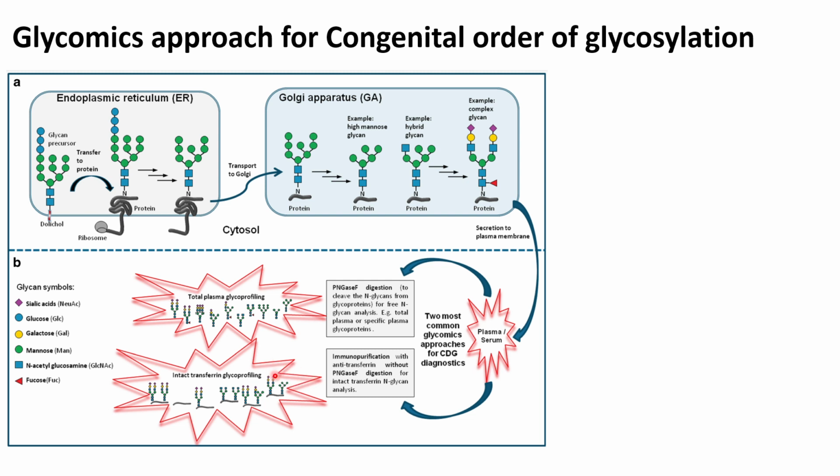So in this case, the glycans will not only get separated, but it will also take the protein backbone chain with it, which can be seen here in this bottom intact transferrin glycoprofiling figure. In this case, the antibodies detect these glycan structures, and then this glycan will also take the protein backbone with it.